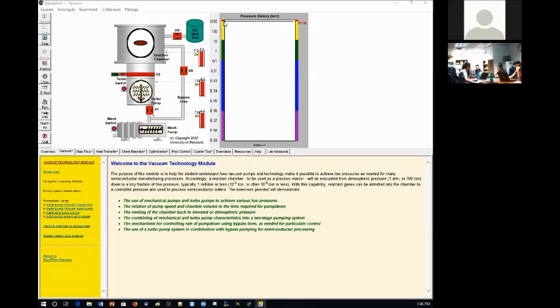So I'm now seeing 760 from each one of these gauges. I have several gauges here. Look at the gauges. These are pressure gauges. You hopefully can see my mouse cursor nicely. And this is going to be our reaction chamber. That's going to be a chemical vapor deposition reaction chamber, this one here. And I have some valves and some pumps to work with, all right?